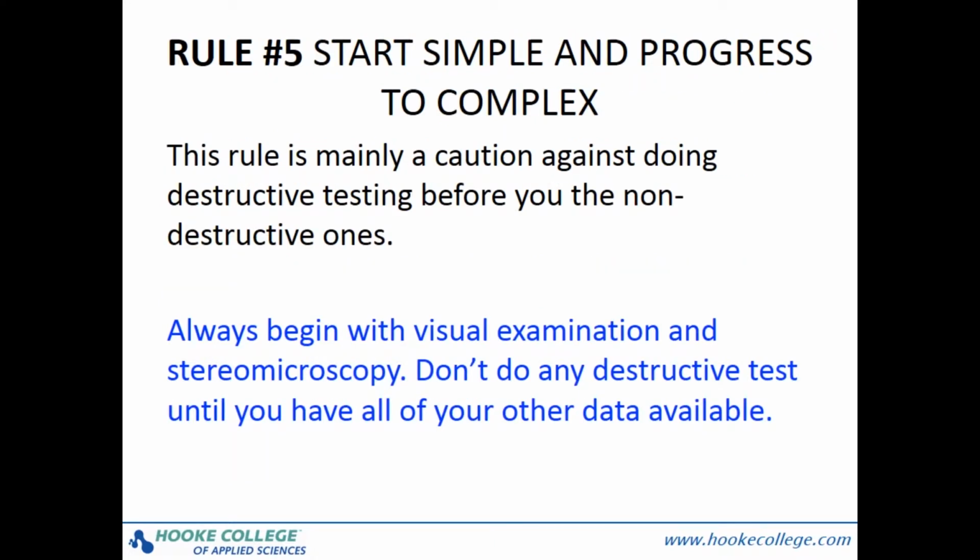Rule number 5. Start simple and progress to the complex. It is just oh so tempting to skip a step or two and jump to the wonderful and expensive state-of-the-art gizmo. Particularly if the boss says, can you run this sample on the gizmo for me? Of course, there's no question mark at the end of that, since it's really not a question. Sometimes you're lucky and it works okay, but it sure is embarrassing for all involved when you get it so very wrong. So I recommend working every contaminant methodically, beginning with the simplest, which is just looking at it, going to the more complex, which is your more exotic instruments.